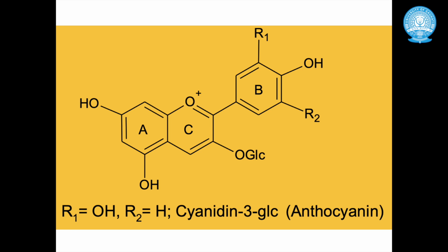But what if we do not have any background information? How will we proceed to identify a compound without any prior information? In that case, we will study the mass.